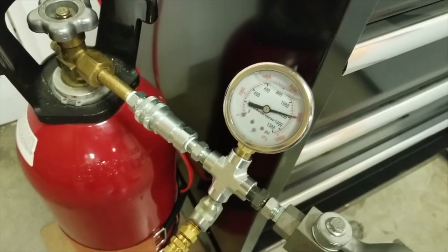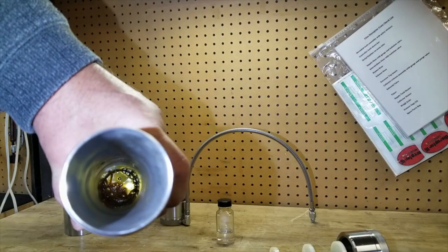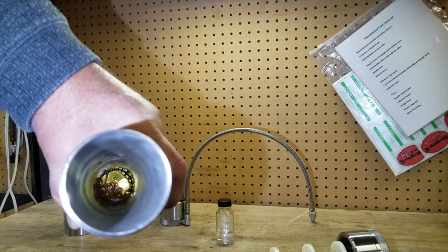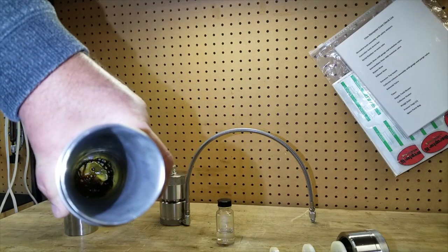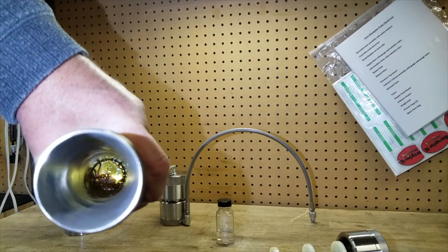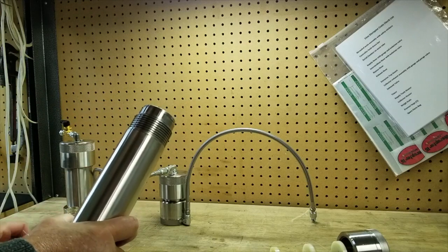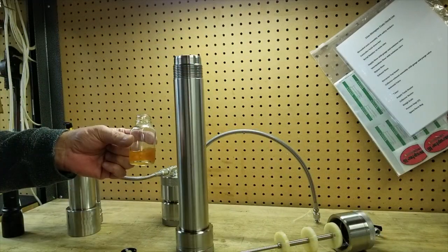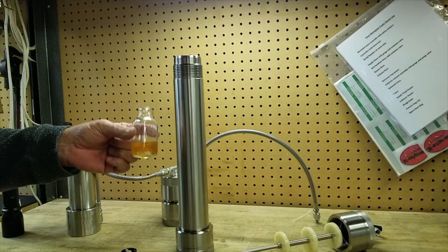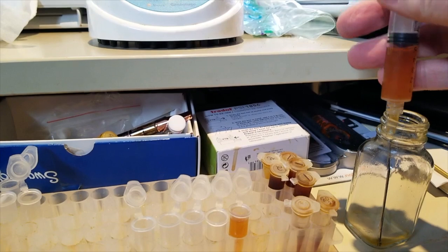We'll be running this extraction at around 1200 psi. After one tank we can see that we have some extract in the collector. I'm going to pour in a bit of ethanol to liquefy the extract and shake it up a bit — and there you can see what it looks like. This gives you an example of the color.